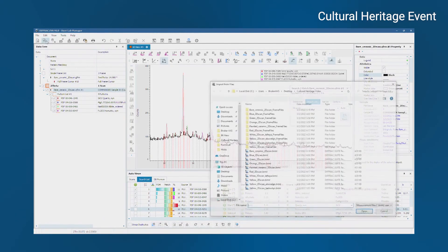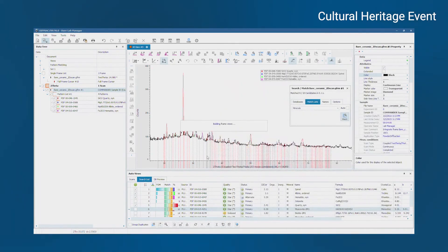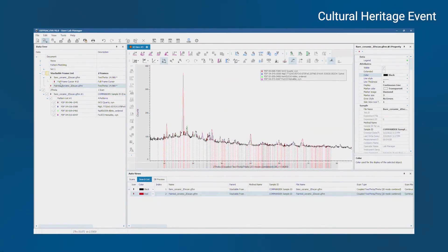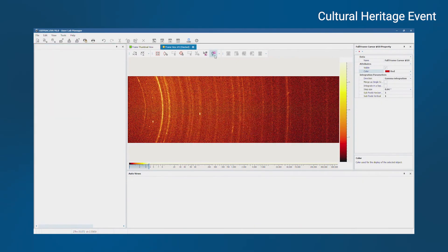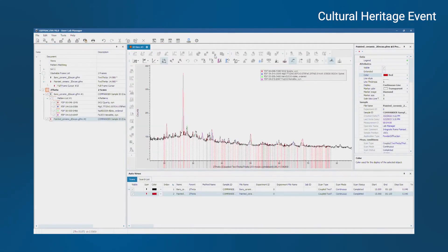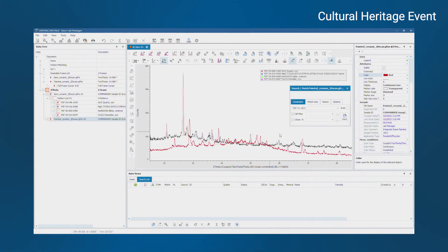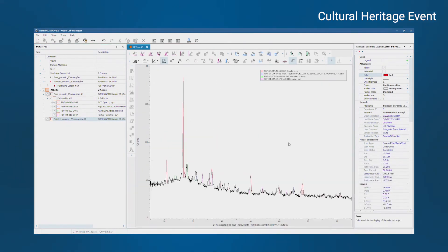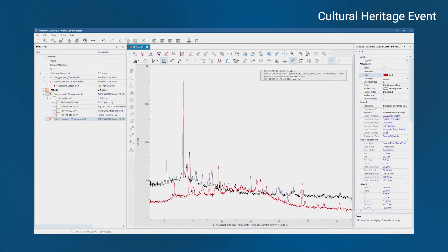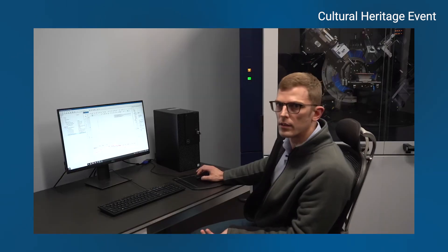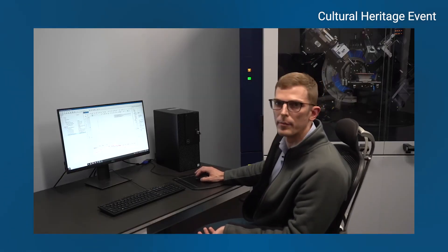Just to show you what the ceramic image looks like, or the painted region looks like. I mean, without doing any sort of analysis at all, you can already see there's peaks missing, and then there's other peaks that are appearing. So there's a lot of different crystal phases present. There's also this hump in the background, which might correspond to some sort of glassy phase in the glazed region that's not present in the bare region.